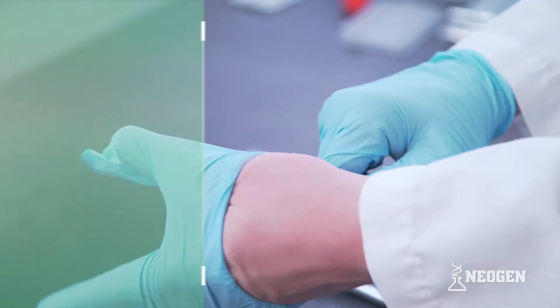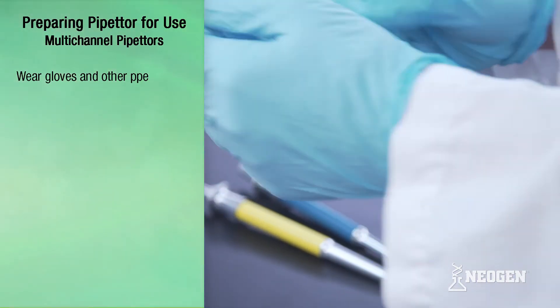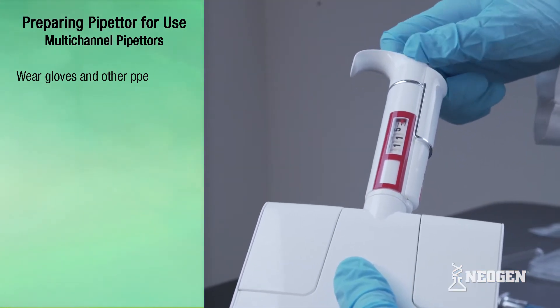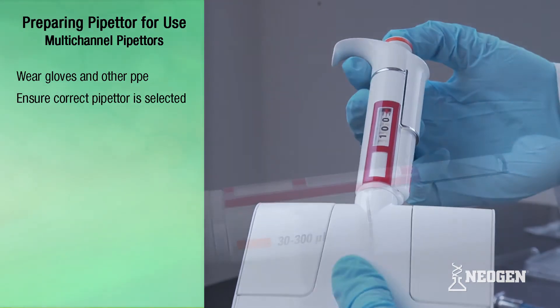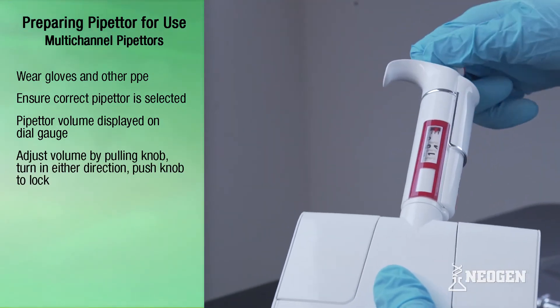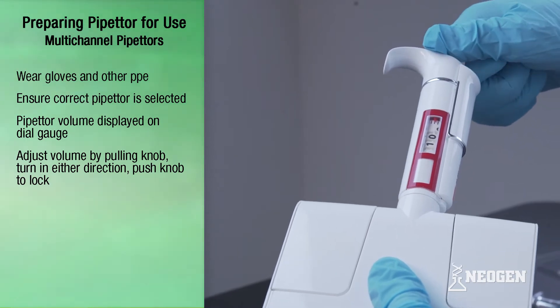It is a good idea to wear gloves and other personal protection equipment for the other steps in accordance with your company policy. Before using a pipetter, it is critical to ensure the correct pipetter and volume setting is selected. The volume a pipetter can draw and dispense is displayed on the dial gauge on the outside of the pipetter. To set an adjustable pipetter's volume, pull the knob on the top of the pipetter plunger and turn the knob in either direction to adjust the setting.